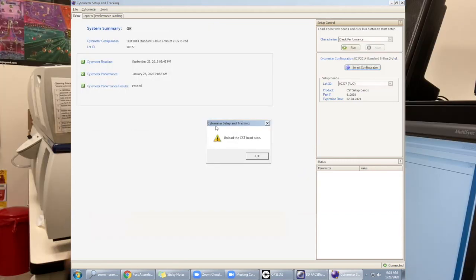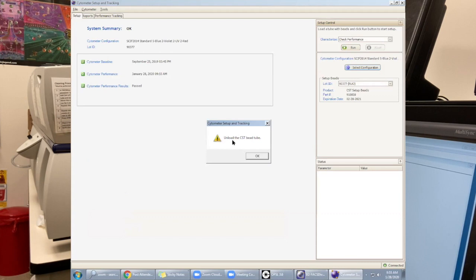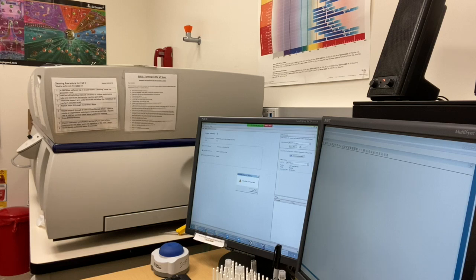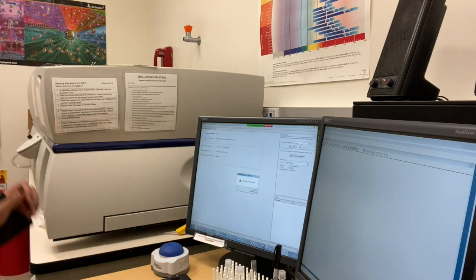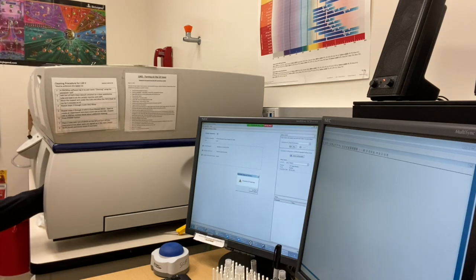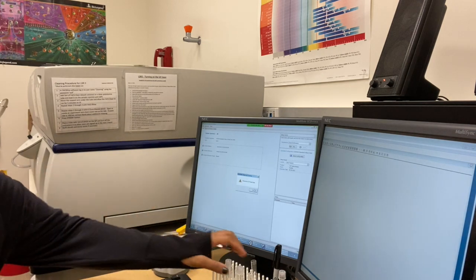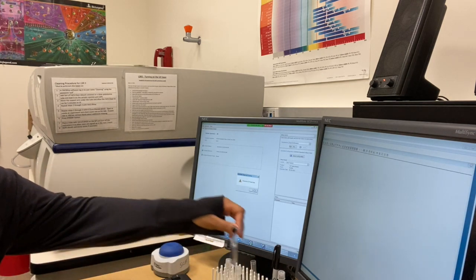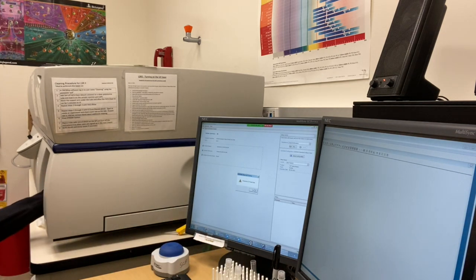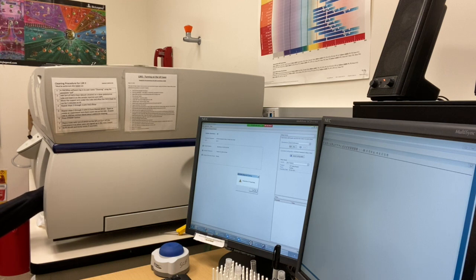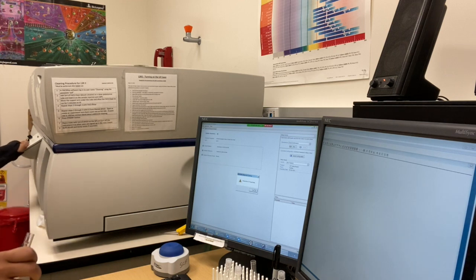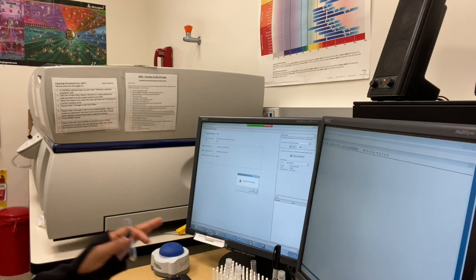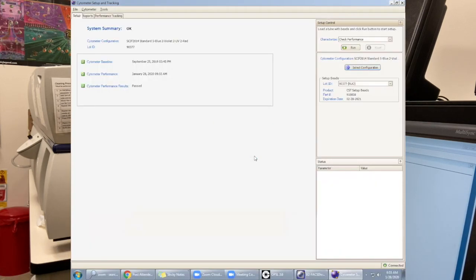Once you're done, you're going to get the screen saying cytometer setup and tracking, unload the CST beads. Make sure that when you unload the CST beads, you put back the DI water for the LSR and put the machine in standby. Then come back to the screen and press OK.